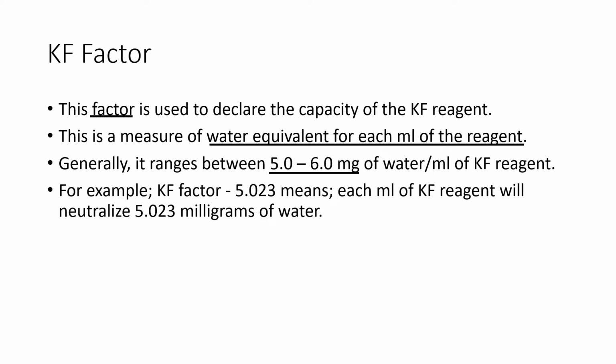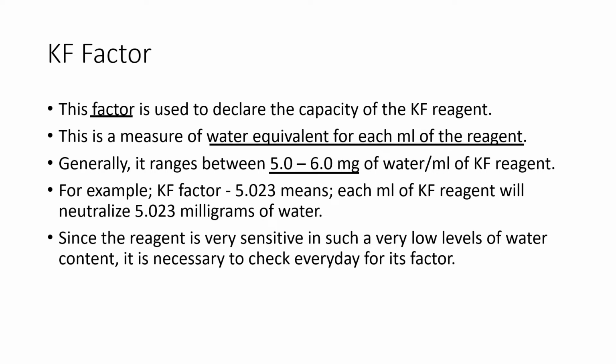If a sample consumes 1 ml of Karl Fischer reagent to neutralize, that means the sample taken for determination has 5.023 milligrams of water. Since the reagent is very sensitive at such very low levels of water content, it is necessary to check its factor every day because it is likely to change.